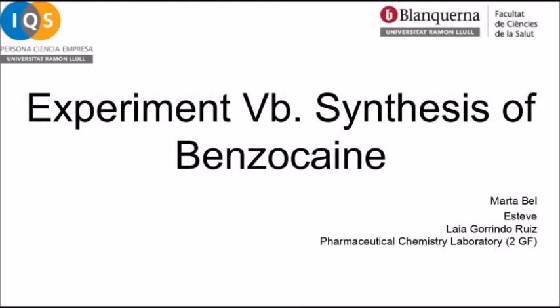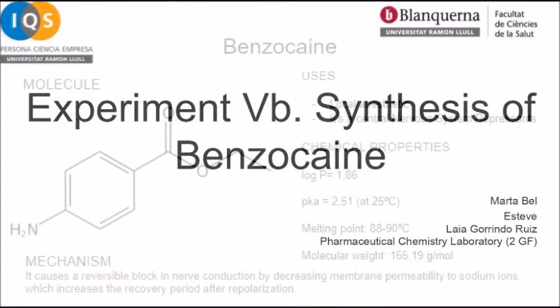Hello, we are Laia and Marta, and we will present experiment 5b, which is the synthesis of benzocaine.